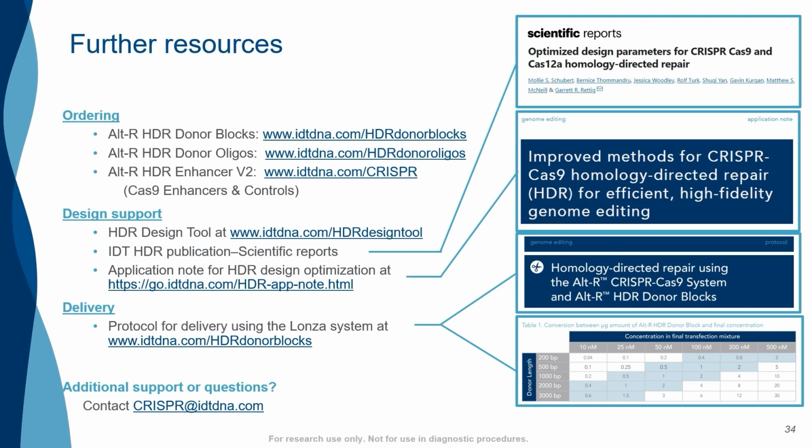Thank you, Edward. There is a second question here. What are the differences between wild-type Cas9 and high-fi Cas9?